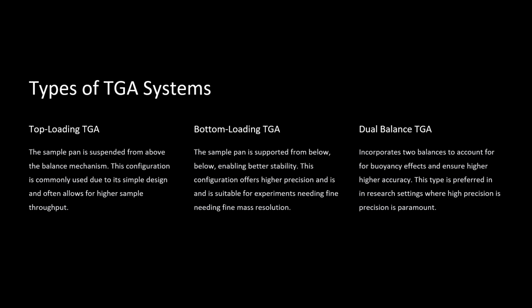It features two balance systems, one for the sample and another for the reference material. It provides simultaneous measurement, enhancing precision by compensating for environmental fluctuations. It is commonly used in advanced research applications.